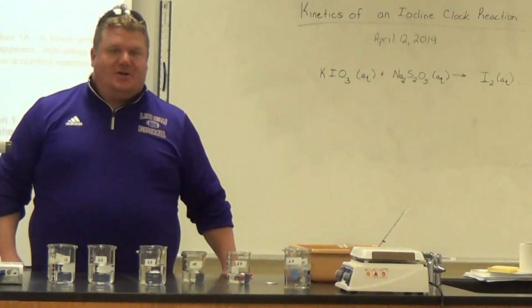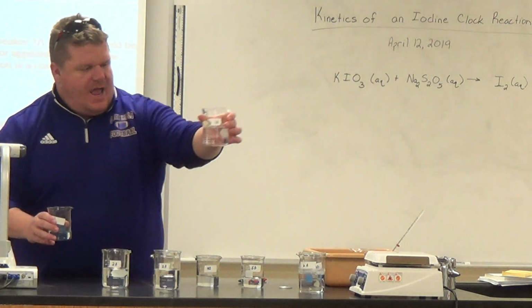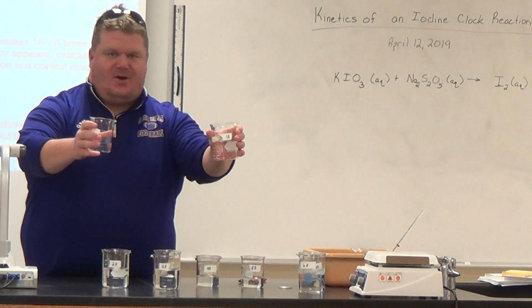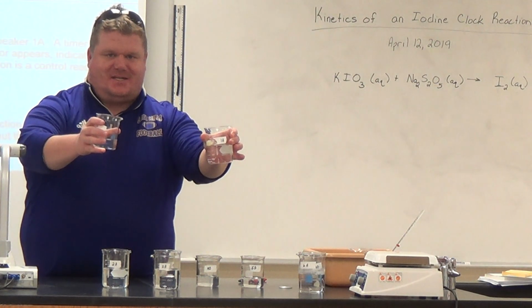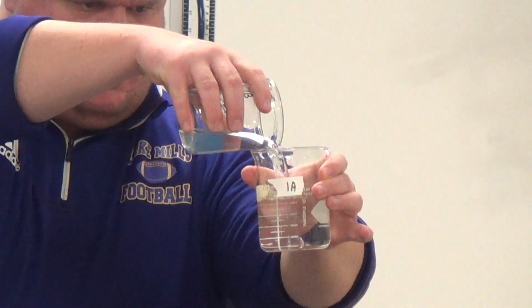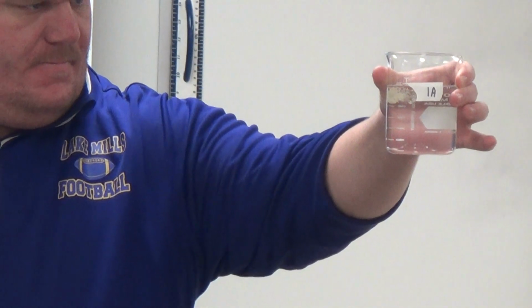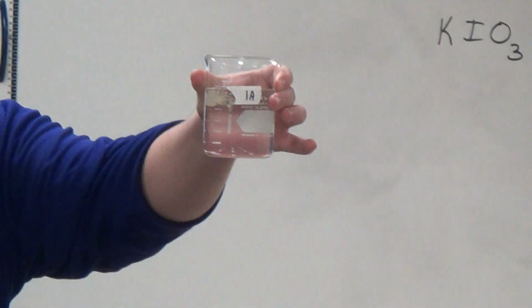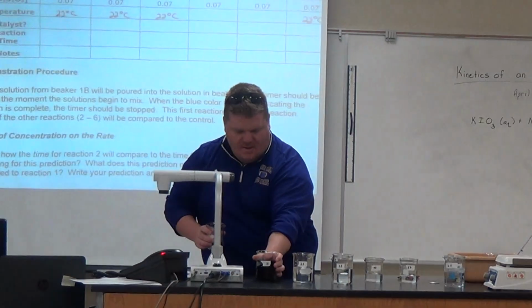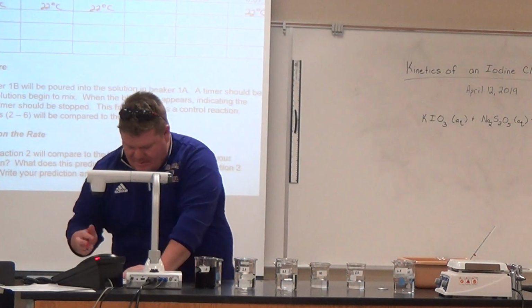Adam, are you ready, sir? Yes. All right, so we're going to pour 1B into 1A. I'll wait till we've got the camera ready to go. We all set, sir? All right. The time, Mr. Manis? 8.08 seconds.